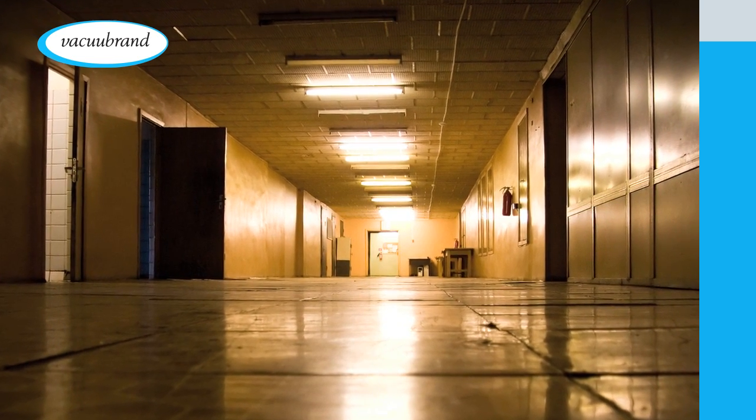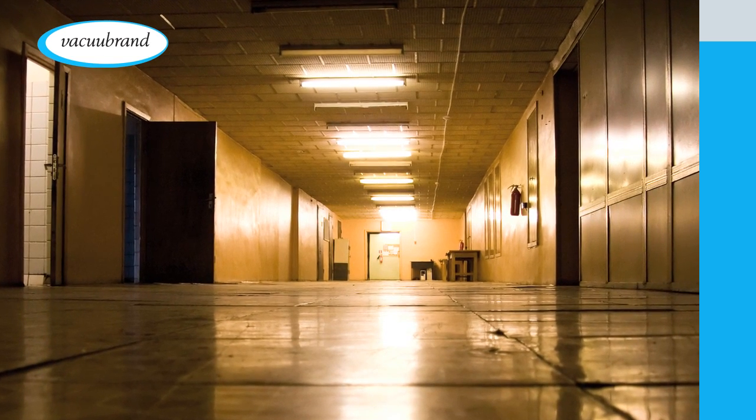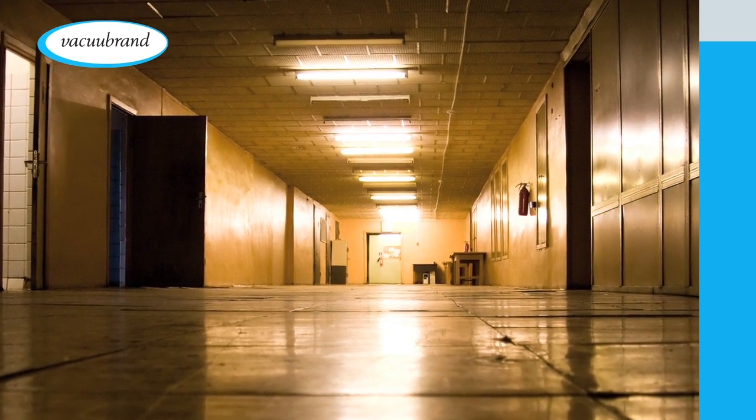Many systems even create vacuum around the clock, even when the building is empty, just so it's available in case anyone is working nights or weekends. That wastes a lot of electricity and contributes to high operating costs.